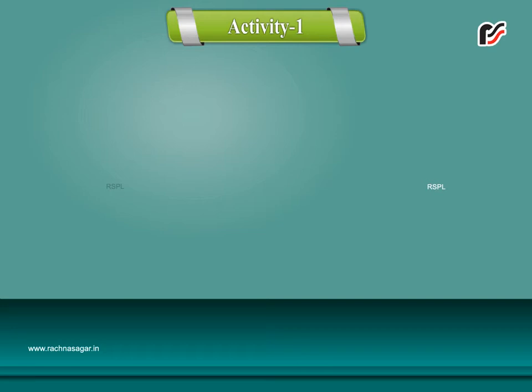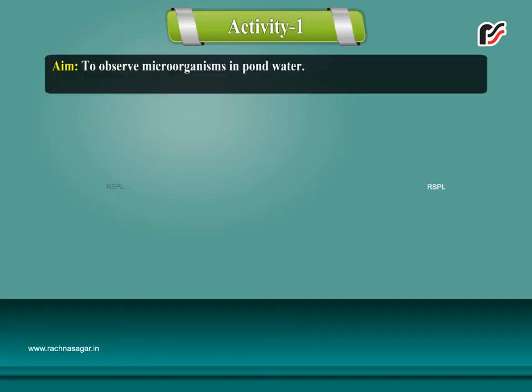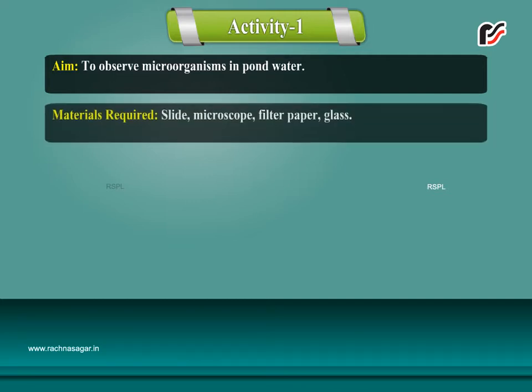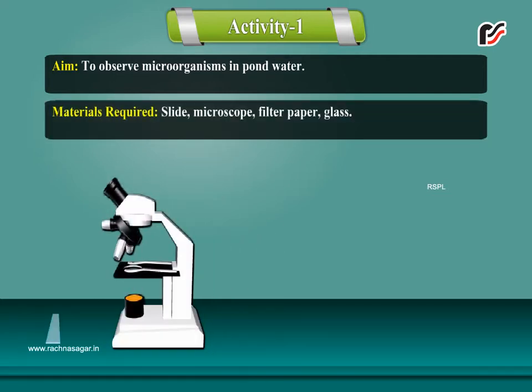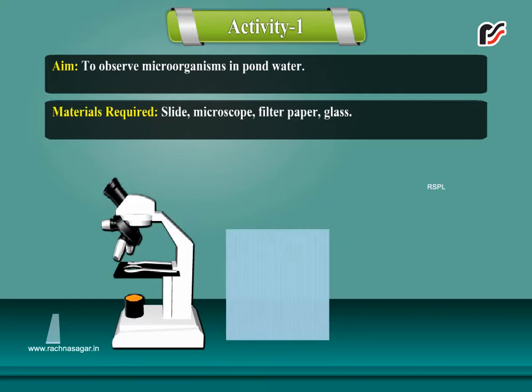Activity 1. Aim: To observe microorganisms in pond water. Materials required: slide, microscope, filter paper, and glass.